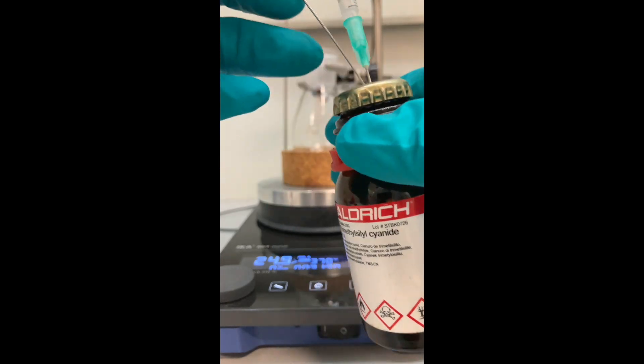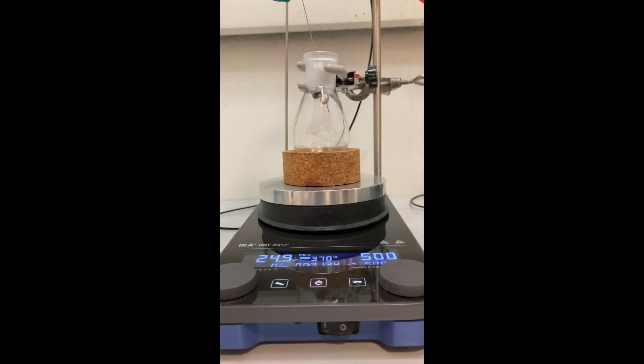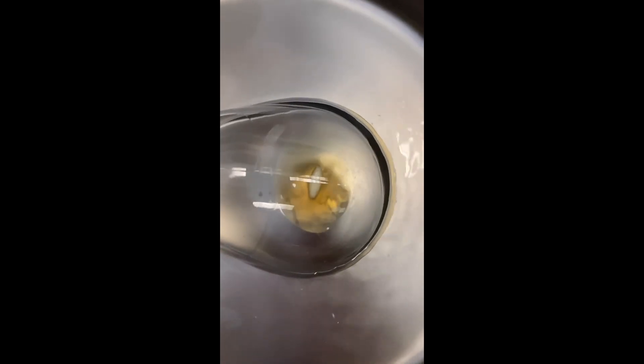Salts such as TMS cyanide or potassium cyanide in an acidic media generate hydrogen cyanide gas. However, I didn't take any additional precautions here because I was working in a well-ventilated fume hood and the scale of the reaction was relatively small. But it is also advisable to use a portable gas detector.